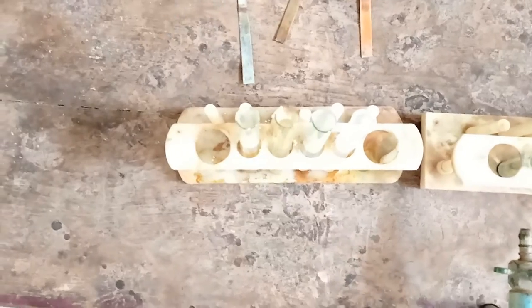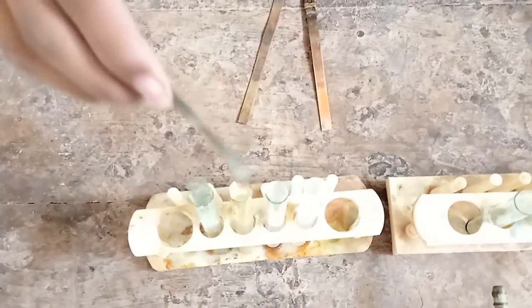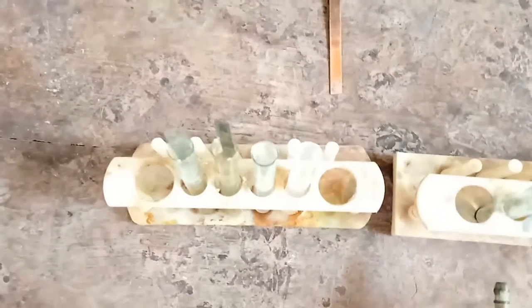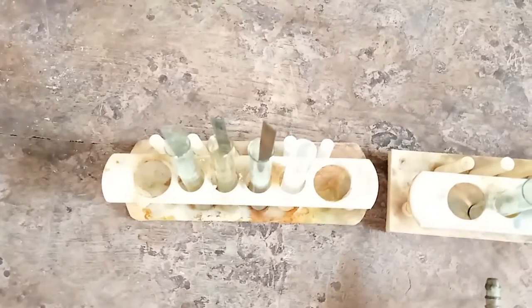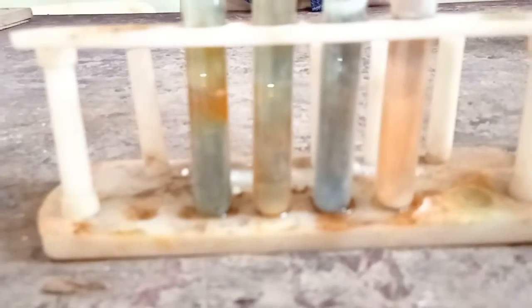So, we first put all strips in Aluminium Sulphate. So, there is no change.